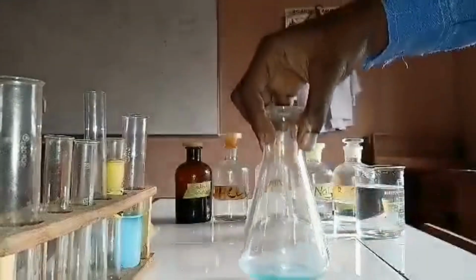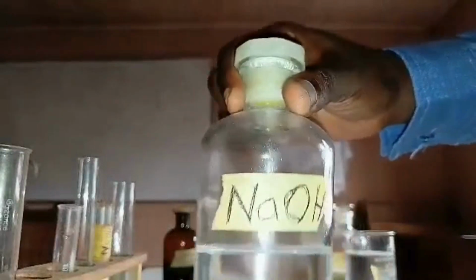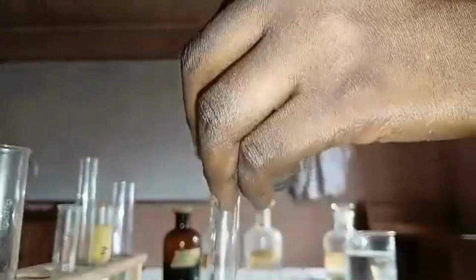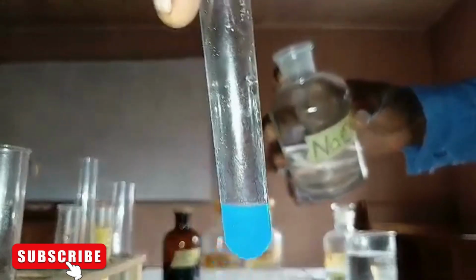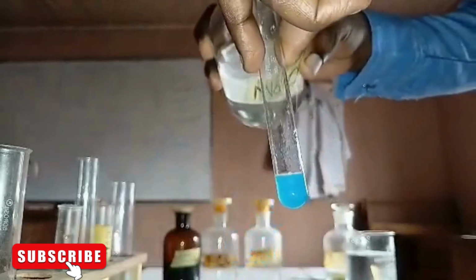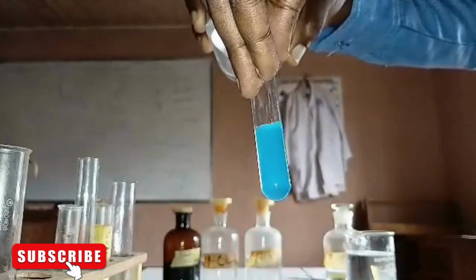So we start by adding sodium hydroxide in drops, where we get a blue gelatinous precipitate. As you can see, a blue gelatinous precipitate, and then we add the sodium hydroxide in excess. Adding it in excess, the precipitate was insoluble in excess of sodium hydroxide.